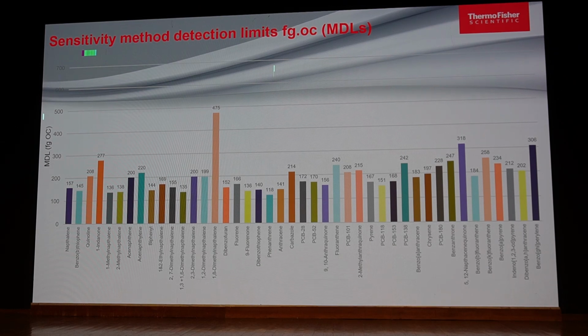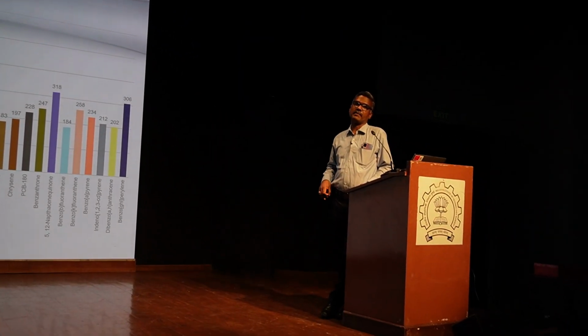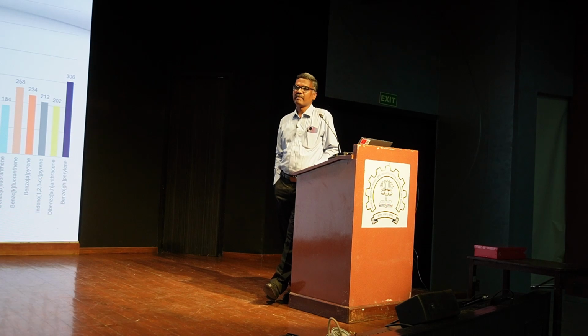And if you are doing soil analysis using GC-ECD, then your ECD will go bad. ECD will not sustain for a long time, because humic acid will mask your ECD. So that is another challenge with respect to soil samples specifically. So you need to use a proper extraction method.